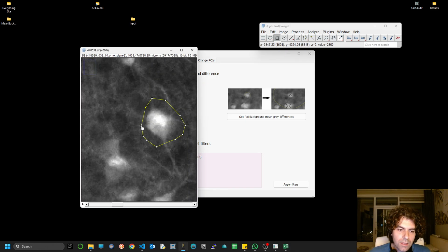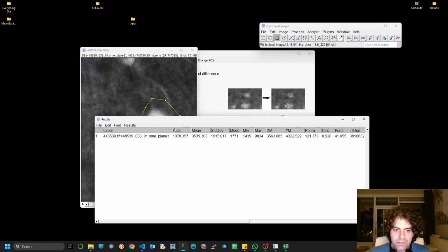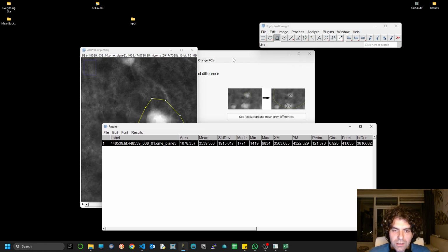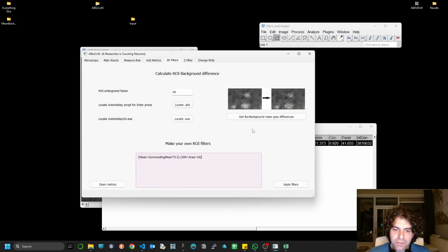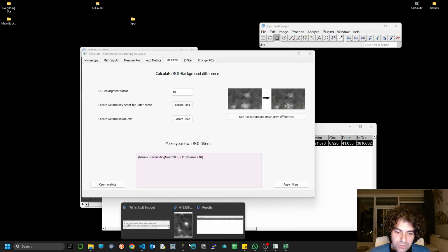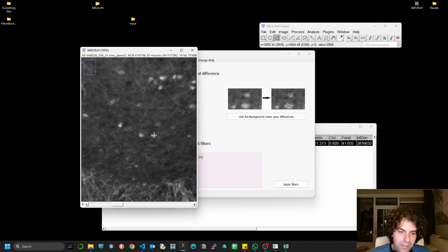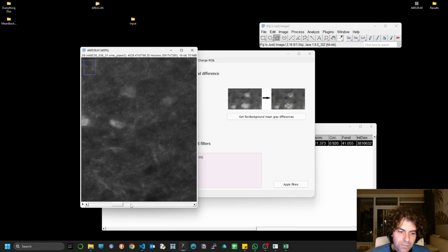So I'm going to just run a few measurements, and you can see that the area is actually 1078. I will do 1100, let's say. So if area is smaller than 1100 and larger than, well, 10 for sure, actually maybe we try to search for a small neuron in this case. Let's see, maybe this guy will do.